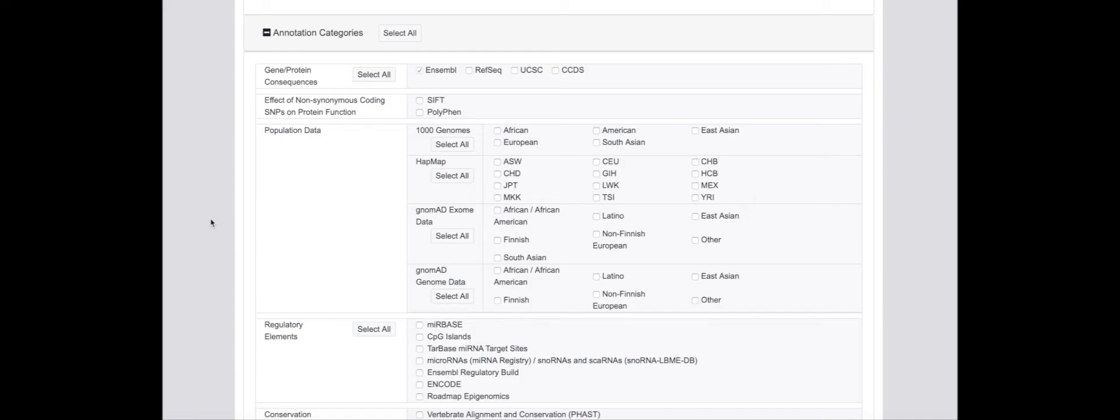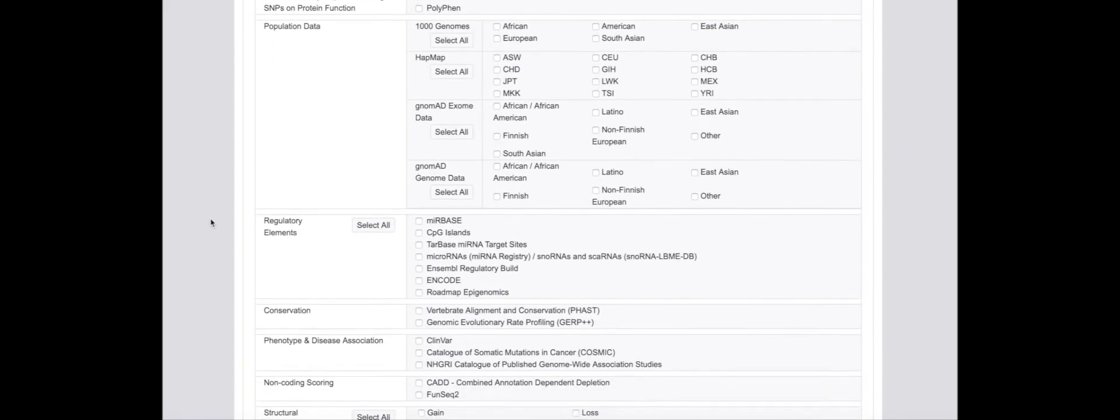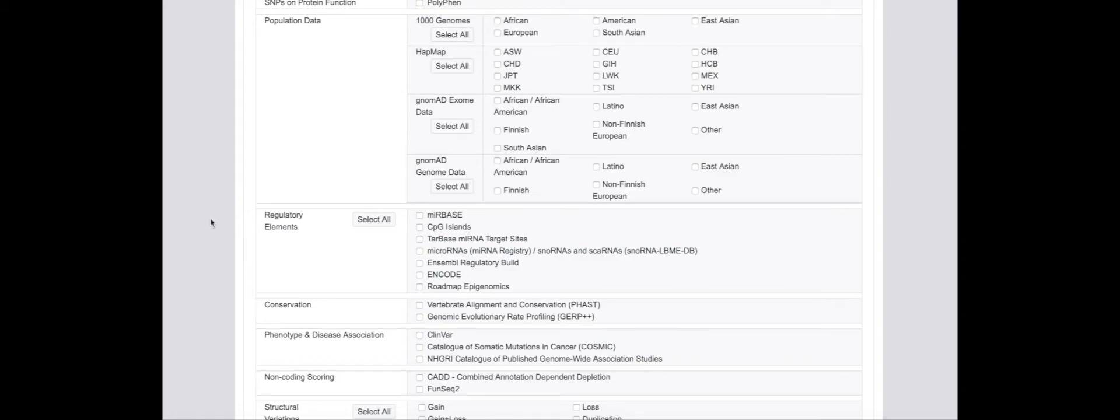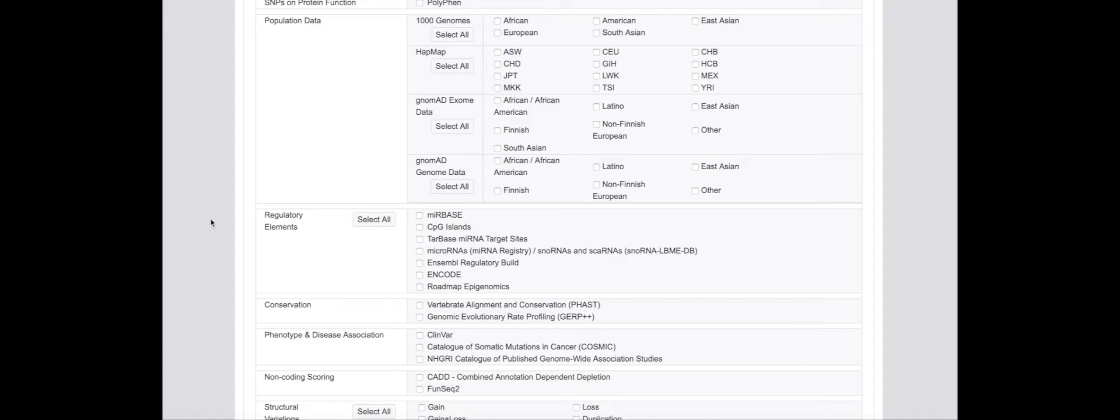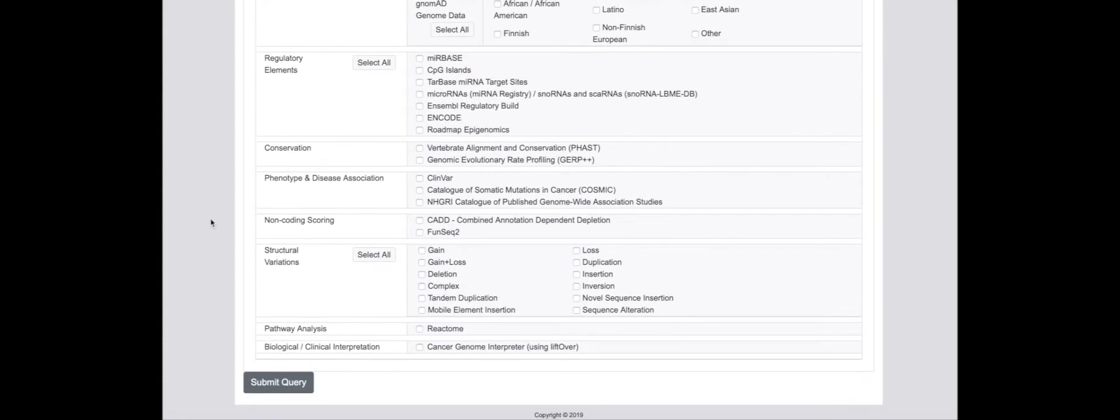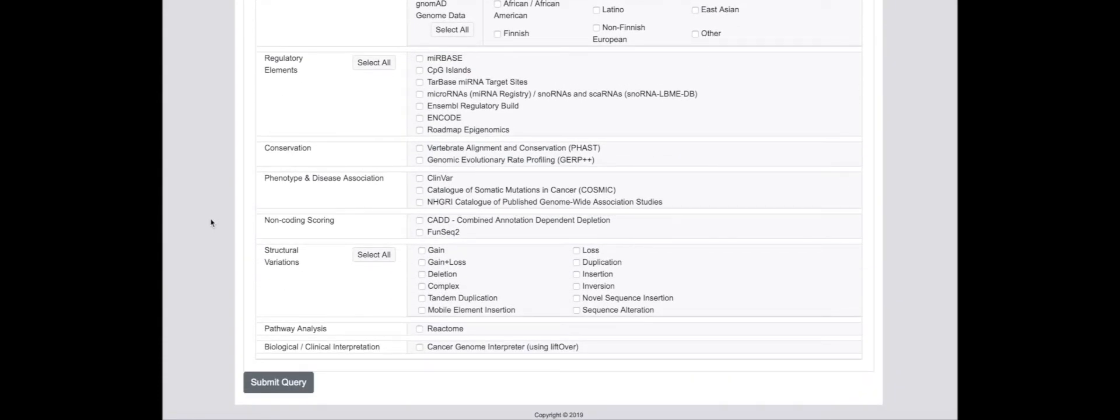Required annotations can then be selected based on the individual requirements of a project application. These can cover gene or protein consequences, effect on protein function using SIFT and PolyPhen, population frequency data from the 1000 Genomes, HapMap and gnomAD populations, regulatory elements, conservation, phenotype and disease association, non-coding scoring, structural variations, pathway analysis, and biological and clinical interpretation.